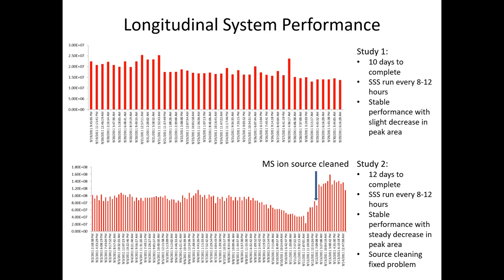And the person who was running it was like, oh, that's a pain. It may not be obvious when you go from injection to injection because the changes from run to run are very, very small. But when you look at it visually like this, you're like, let's fix this. So the instrument was vented and the source region was cleaned, and then the sensitivity popped right back up. That was the only change that was done.